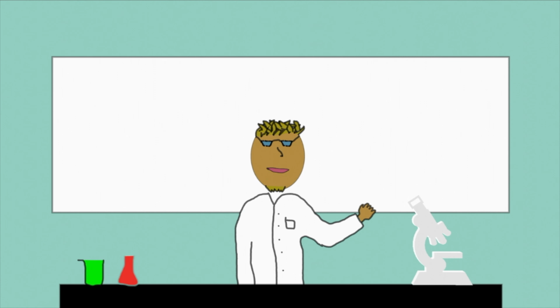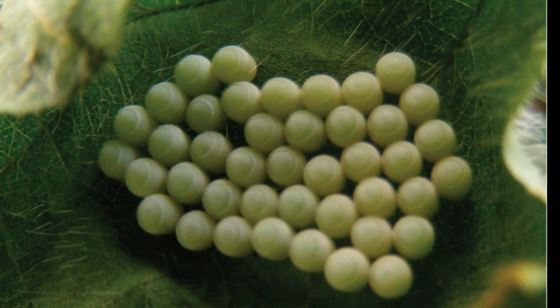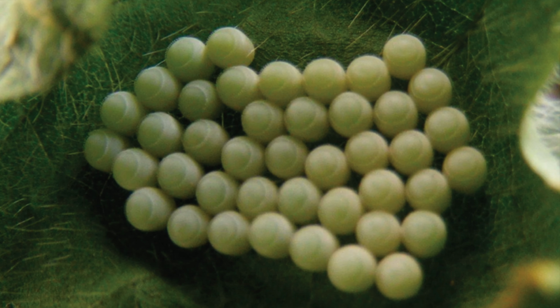Hey everybody, welcome to my fictitious laboratory, where today we're going to be looking at stink bug eggs. So let's get started. Here is an example of what the eggs looked like before I collected them. However, mine were found on the side of a tree.